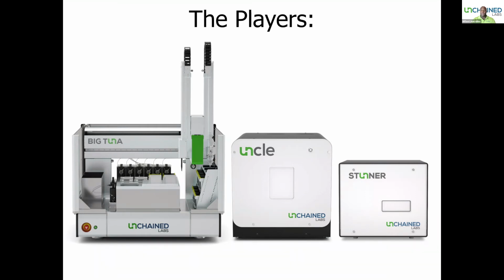What we've done so far is we started with a large number of candidates, right? We've gone through a number of construct screening tests, and we're able to down select the right ones, if you want, and we have a smaller number that we want to then take to develop and screen for the right formulation. And so if you have to imagine being able to screen through, let's just say, 12 formulations, right? If you have maybe 3 candidates, those are 36 different buffer exchanges that you have to do. That's both time consuming, right? And also not always easy to scale. And so if you could automate that, you could see the benefits of doing so pretty readily.